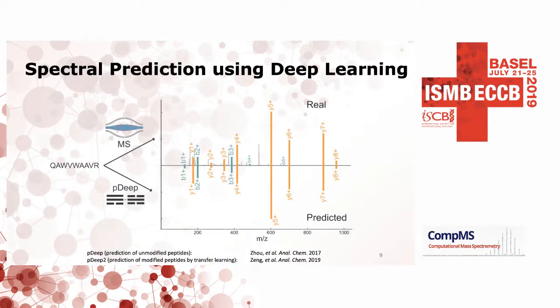Therefore, we can take advantage of more fragmentation patterns learned from the MS data. Instead of learning simple rules from statistical results, a lot of deep learning-based algorithms have been proposed recently to generate more precise fragmentation patterns and predict theoretical spectra.